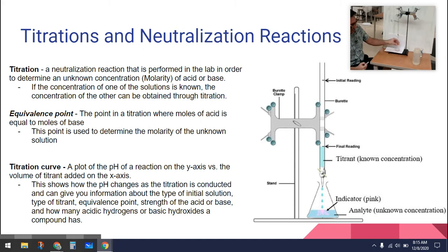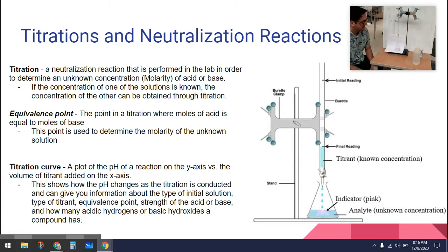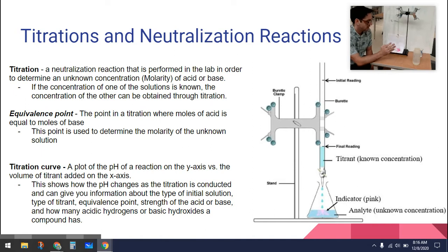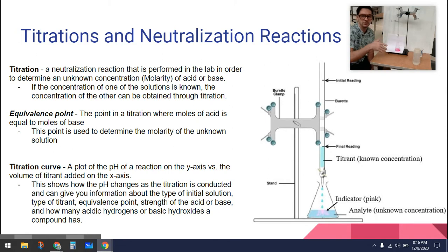But when you stir it the pink goes away, because the base is reacting with the phenolphthalein but then gets neutralized by the HCl. We keep adding and adding. In a titration you're going to do three trials. Usually I do one throwaway trial first where I just add it really fast to see roughly where the neutralization will occur.